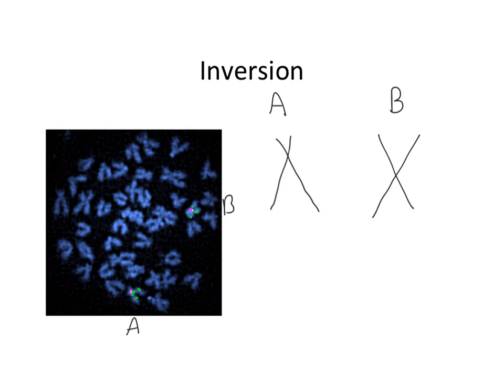Now in this experiment, we have 3 different probes, so I'll call them probe 1, probe 2, and probe 3. And because we only have 2 colors but 3 probes, 2 of the probes necessarily are going to be the same color. So we're going to say probes 1 and 2 are green, and probe 3 is purple. If we look at the location of these probes on chromosome A, it looks like the purple signals are above the centromere, and then there are 2 pairs of green signals, one near the centromere and one about halfway down the long arm.